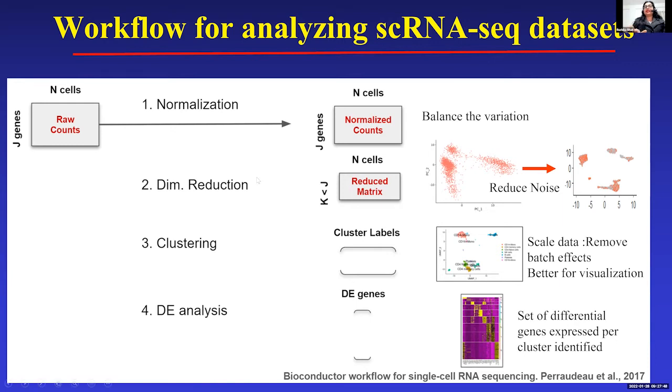The next step would be dimensionality reduction. Not all the genes within a cell will give me some intuitive strength about what the cell is and how I bin them based on their properties or biological inference. The genes that are highly variable will give me a more intuitive answer towards which cells are close together and bin together.